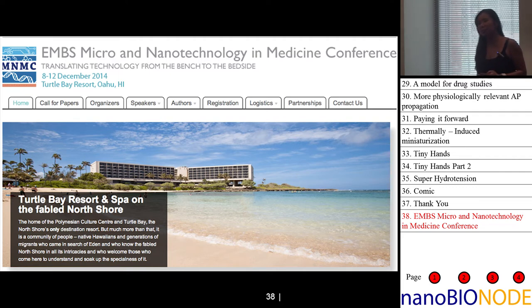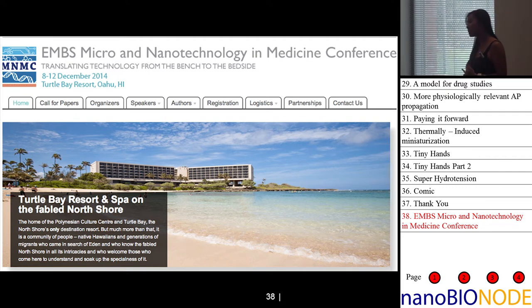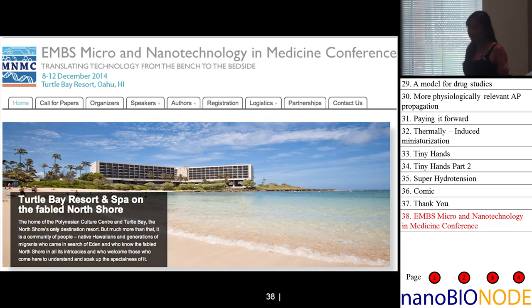Yeah, so we're moving over. So we're trying to do the same enhancements with chemiluminescence now, and that's why we moved to electrochemiluminescence. And the urine study that we did was done all in bright field, so we just did colorimetric. But colorimetric is still really challenging to try to improve upon. So I think chemiluminescence seems pretty hopeful to me right now. I think just even being able to do all this with a lower powered laser and a less sensitive detection setup would already help a bit, but I do definitely want to move away from fluorescence eventually.